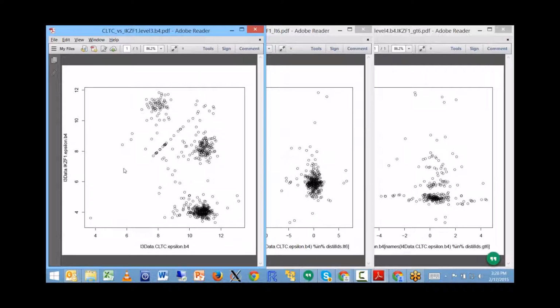Okay, so this is a way less sophisticated looking plot, but it should be the same data that Chad showed. The first one of the first plots showed basically these 3 clusters of expression levels in level 3 data. And one thing is that I think you, Chad, mentioned that this cluster down here was reproduced in other batches, right? That's correct. But this one was not.